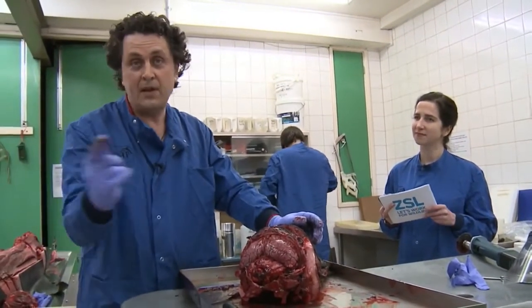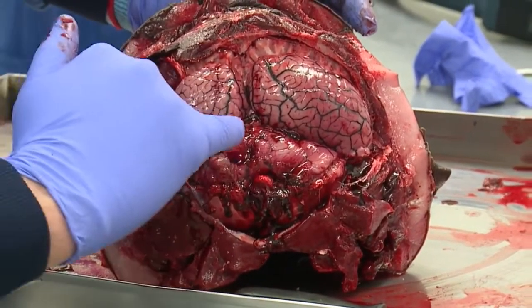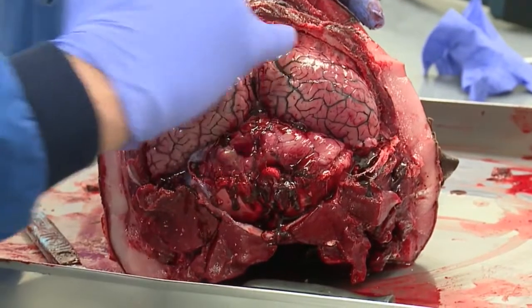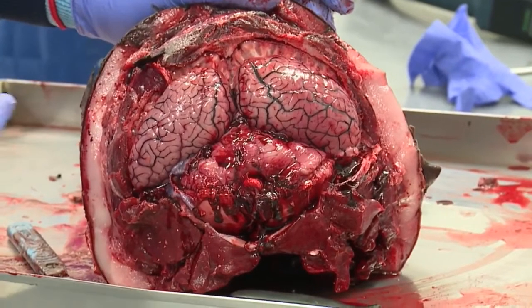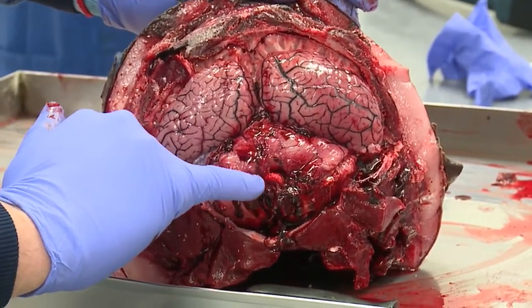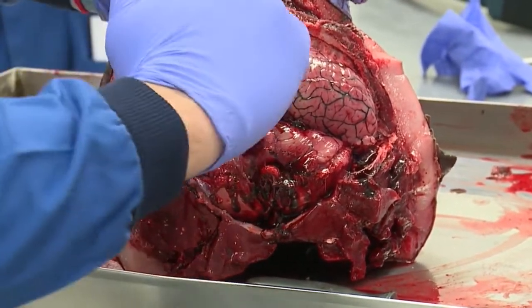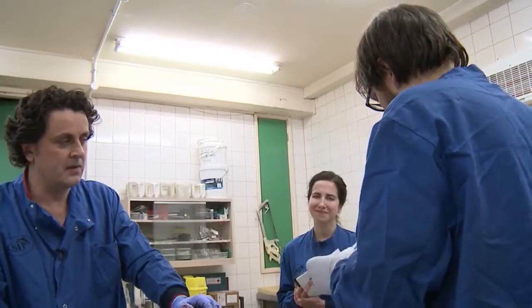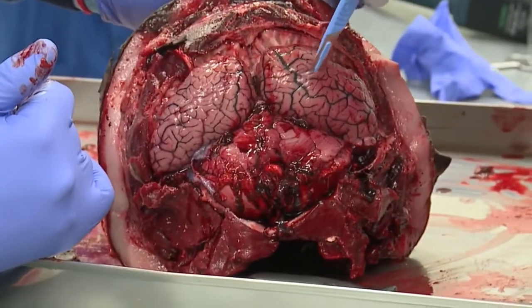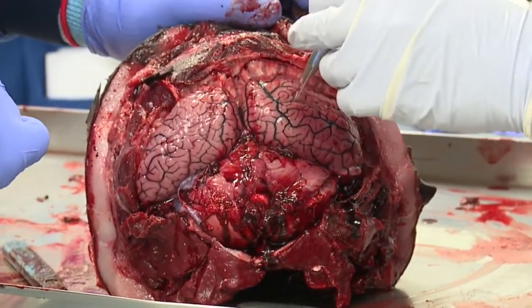So for the camera over here, in case it all goes horribly wrong trying to take it out, we've got two parts of the brain, broadly speaking. This is the cerebrum. This is the voluntary control, the kind of the id and the ego in you and I. Underneath that is the cerebellum with the spinal cord sticking out. And that's the unconscious control, so heartbeat, breathing and so on. You can cut just there, Matt. Go through into the meninges and then take a swab. Is that right? Yeah, brilliant. And then down. Thanks, mate.